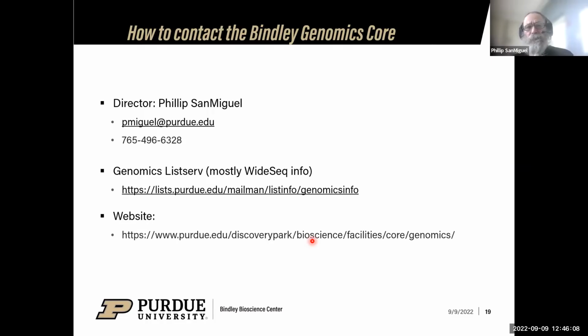Now, if you do that, and you have a very complex pool of cDNA, you'll get an idea of, say, what the most expressed messages are in your pool. It's not like you're going to detect information the way you would from doing a full RNA-seq. In essence, that's what you're doing. If you take cDNA, you're doing RNA-seq, but at very low coverage. It's not the same as doing 30 million reads. You're not going to be at that depth. But anyway, yes, cDNA is possible.